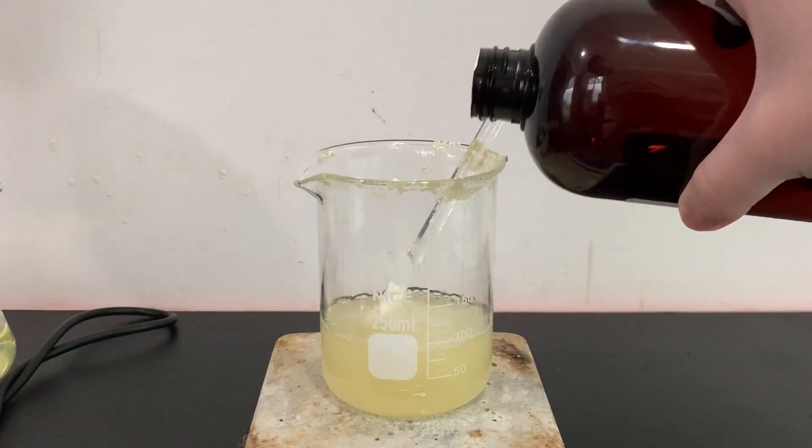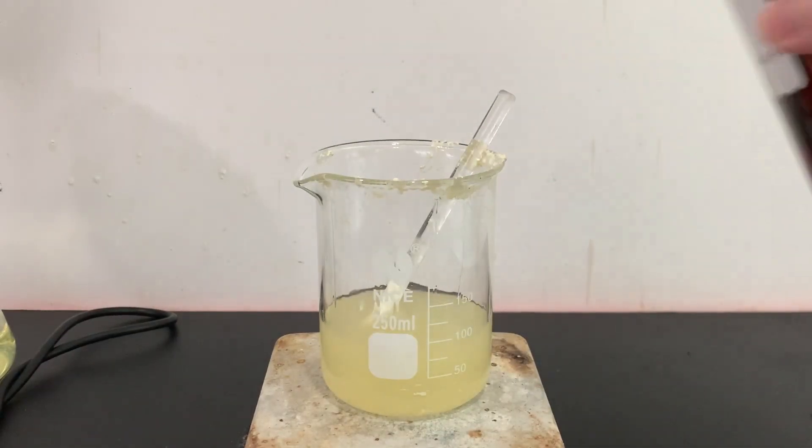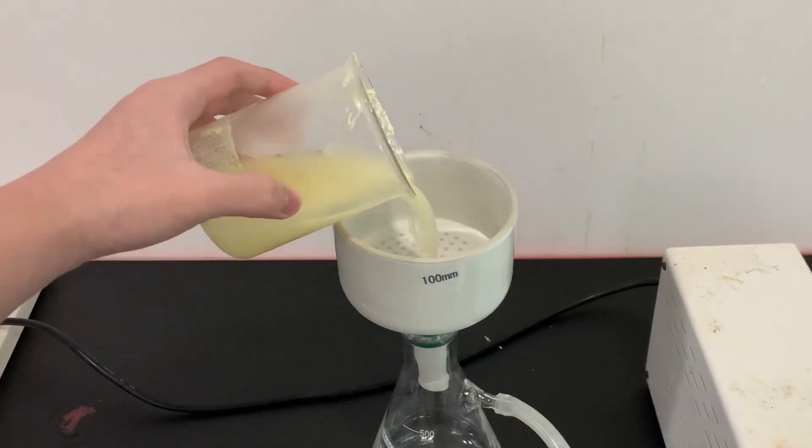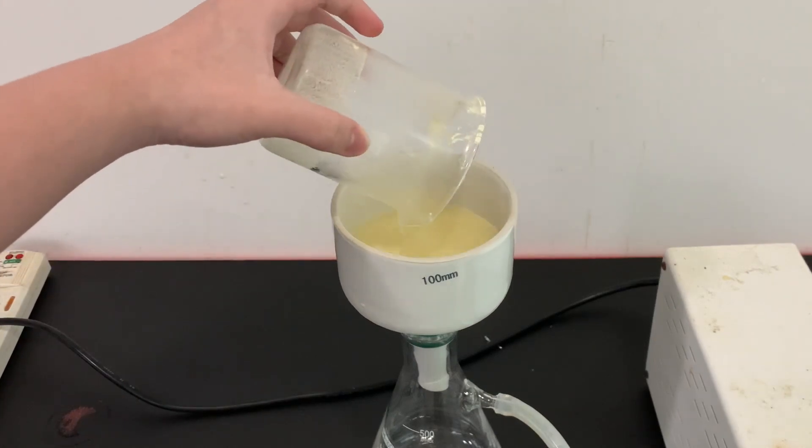To purify the luminol, I did a recrystallization by dissolving the crude in boiling ethanol. The purified luminol is again separated by vacuum filtration.